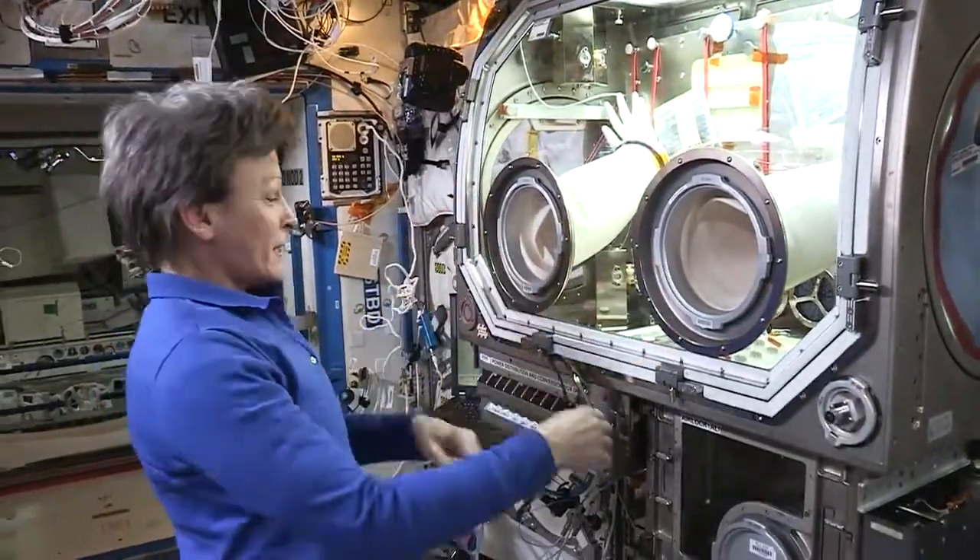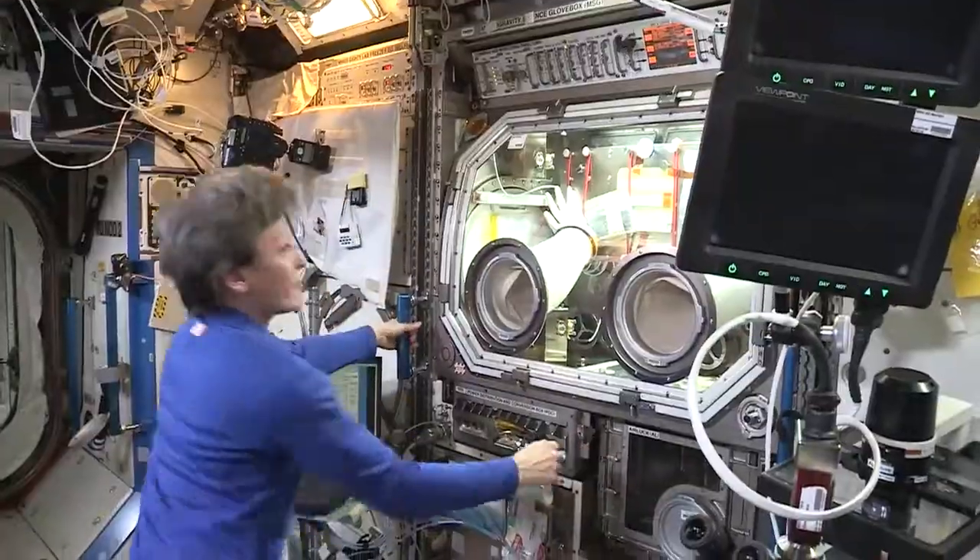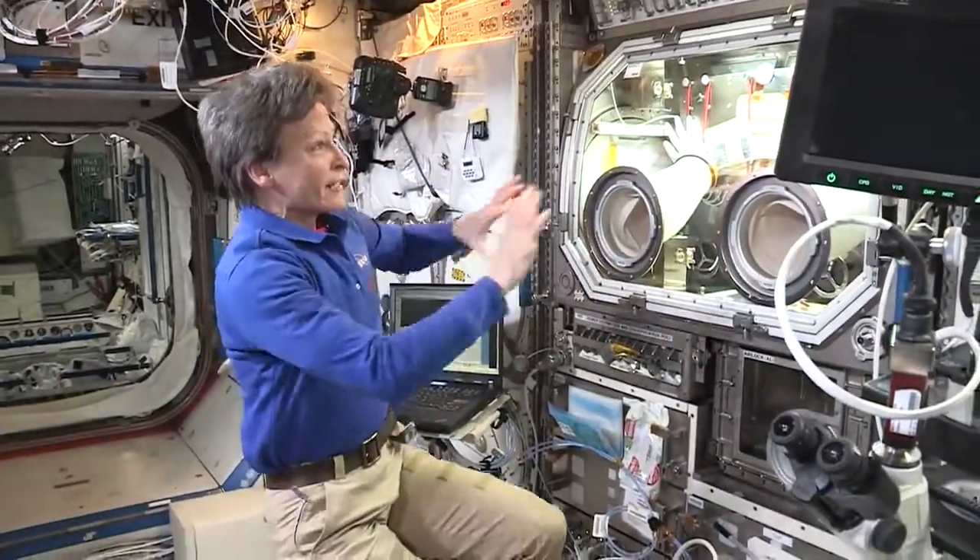It's kind of like a transformer. At the end of the day when you're done working with it, you just push it back into the rack. There we go — and it fits right in very nicely within the rack volume.